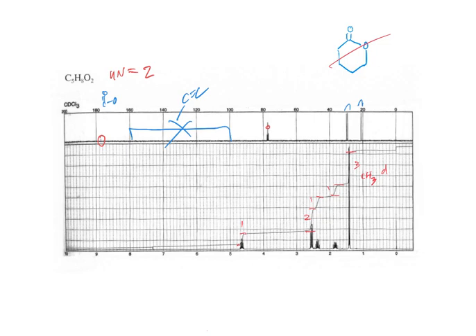A 4-membered ring with a methyl off of it? Well, if we went to a 4-membered ring, we'd have 2 methyls or an ethyl off of it, right? If we had something like this, it would have 2 carbons coming off. So it has to be probably a 5-membered ring with 1 methyl group off. So we have 3 possibilities then. We could have the methyl group here.